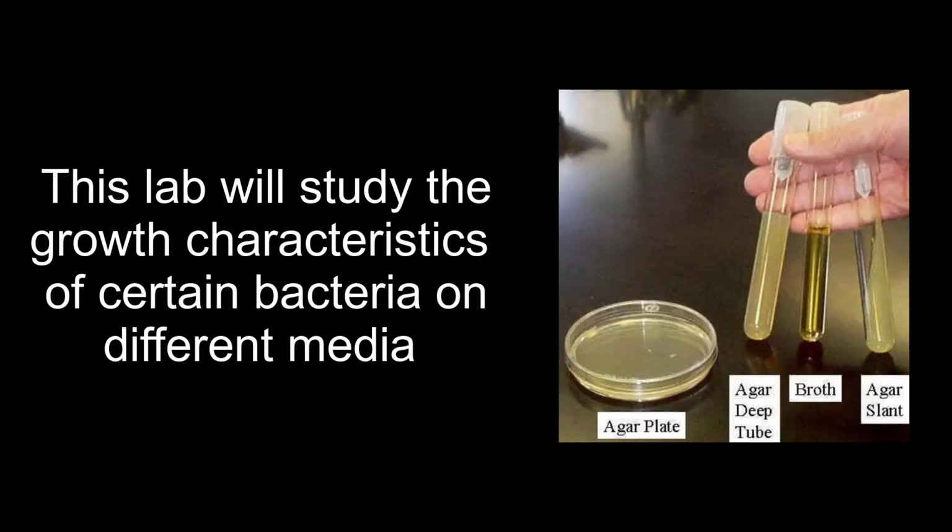Subcultural Characteristics Lab. In this lab, we will study the growth characteristics of certain bacteria on different media. You can see these media pictured on the right side: the Agar Plate, the Agar Deep, the liquid broth, and the Agar Slant.